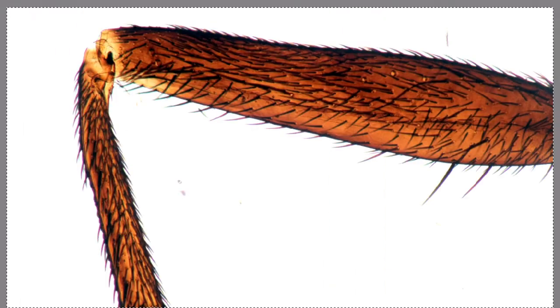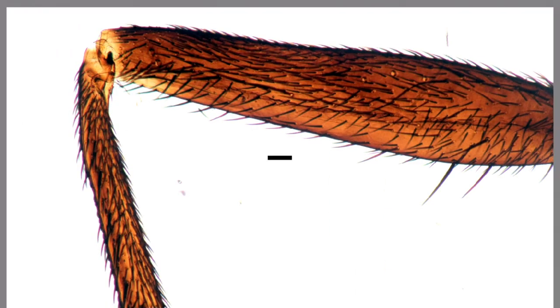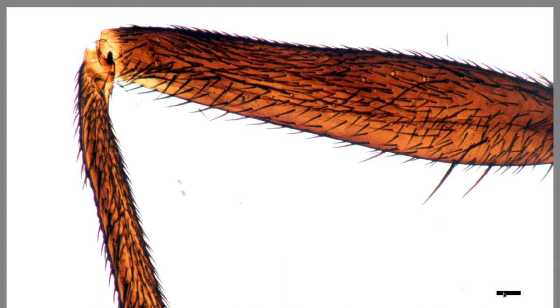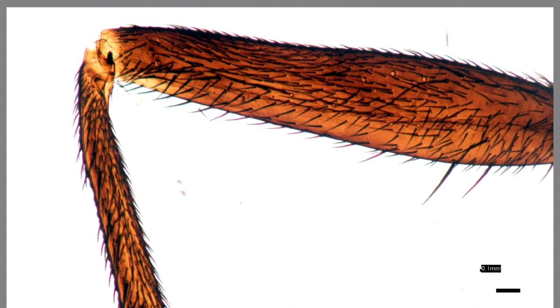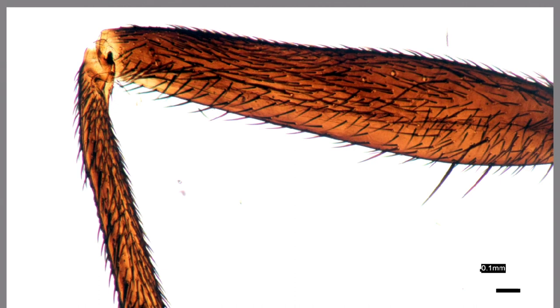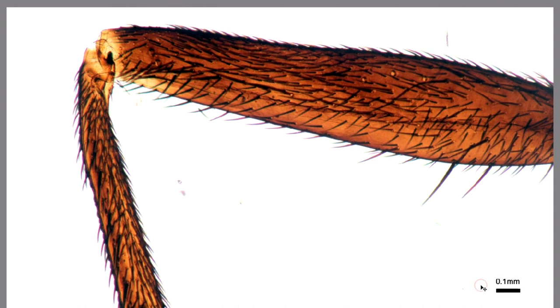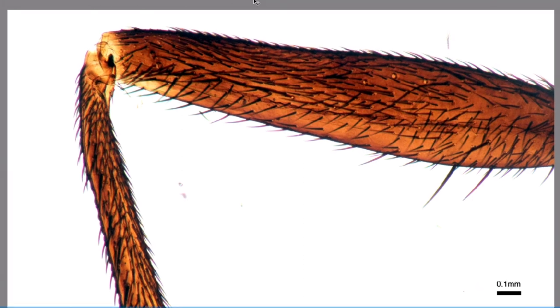And in Photoshop, this is on a separate layer. So I'm copying it and I'm pasting it now into the micrograph of the fly leg that I'm going to be using here. And it's just important that both of these pictures, of course, have the same resolution and the same size and everything. And then what I have to do at the very end is I'm simply going to type in now the dimensions. So that's a 0.1 millimeter from line to line. I'm making it a little bit larger. And because everything here is on a separate layer at the end, the only thing that I have to do is I have to flatten the image and I have to export it and save it. And that's, we're finished.